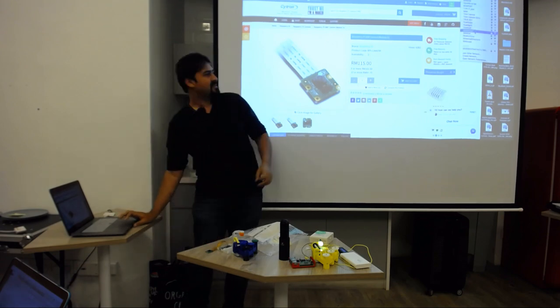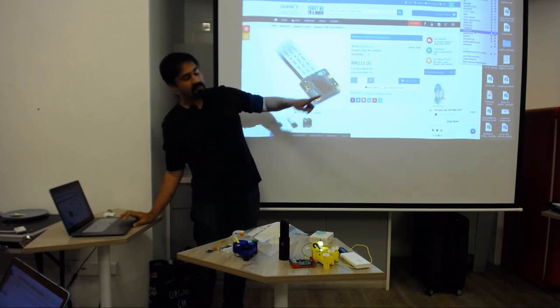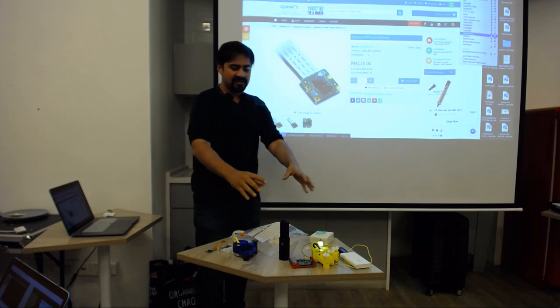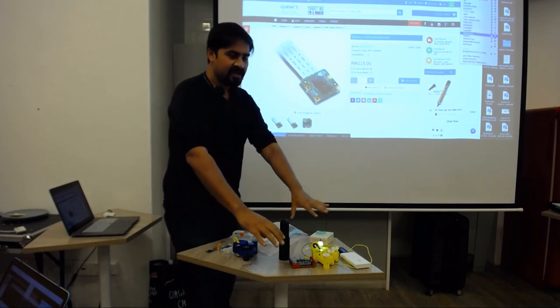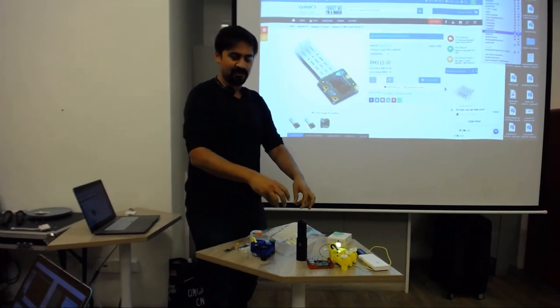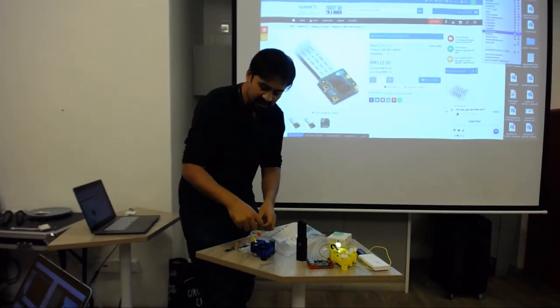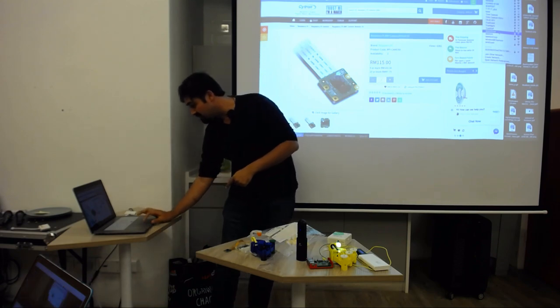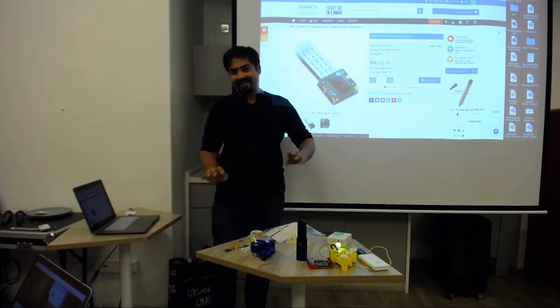There is a Waterscope Pi as a Wi-Fi hotspot. So what this thing is doing, the Raspberry Pi is doing, is it's creating a tiny little Wi-Fi hotspot that you can connect to. Because you can't look at the specimen unless you connect to it. And so you connect to it this way. I'm not going to tell you the password yet.